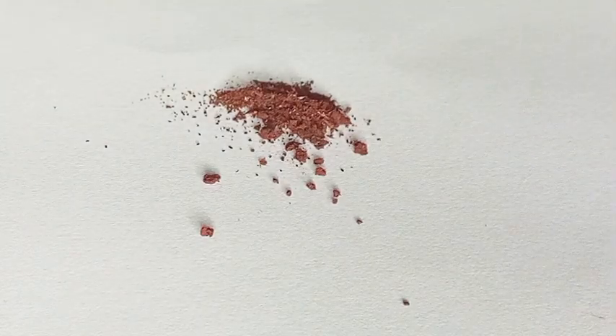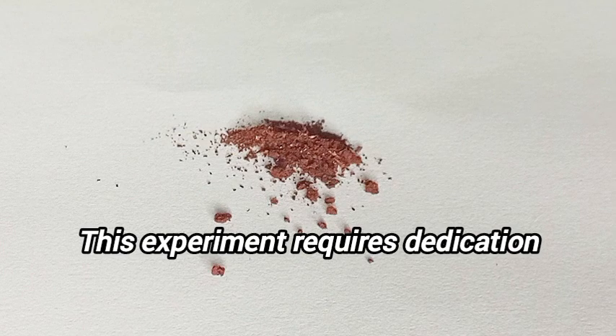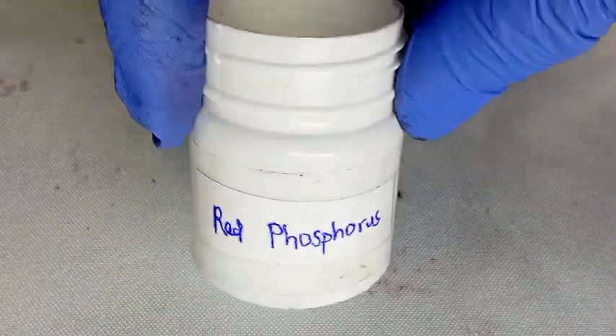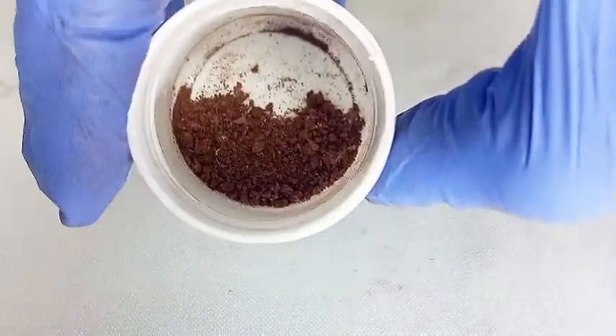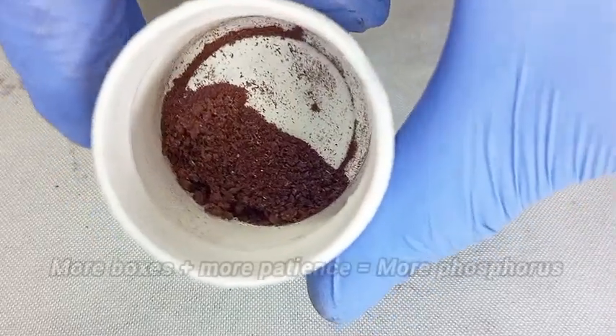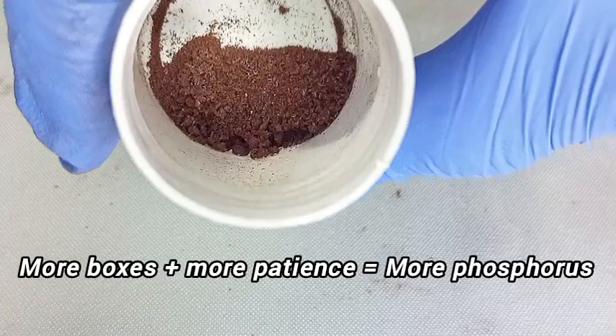The amount of phosphorus from this batch is small, which shows that for this experiment you need real dedication. Before filming this video, I stripped about 100 boxes and got a very decent yield. So the rule is simple: more boxes plus more patience equals more phosphorus.